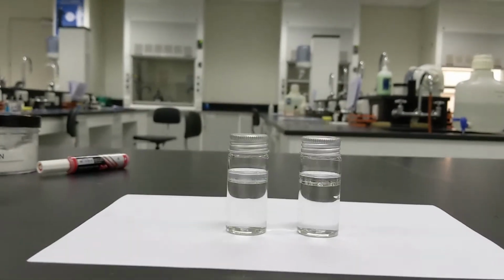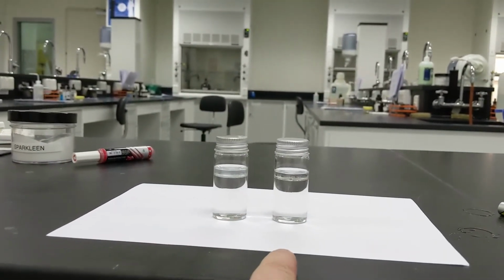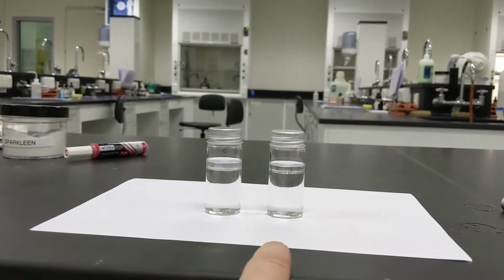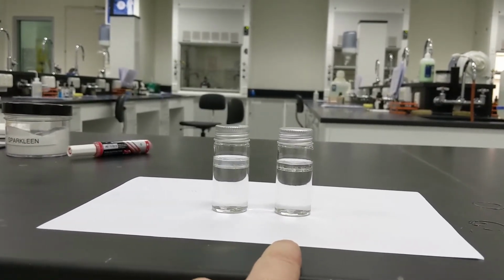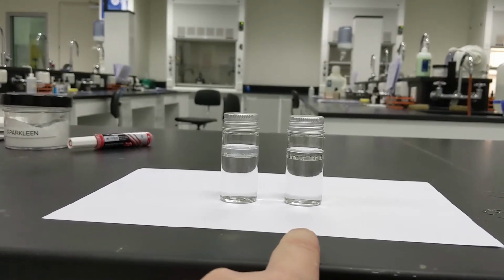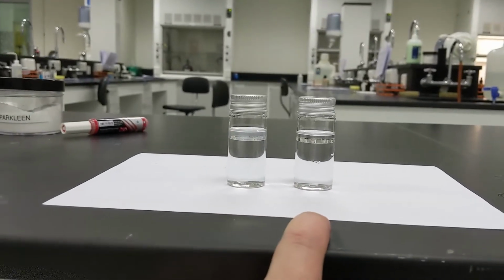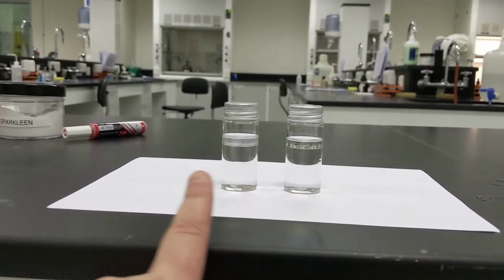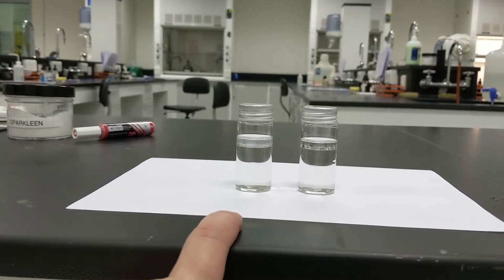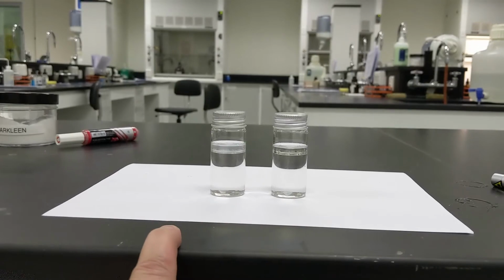I'm going to add soap to one of these, and I'm going to add an egg yolk to one of these. Now, full disclosure, I've done the egg yolk in the kitchen all the time when making some food, which I might explain a little later. I certainly have in class. I have not done the egg yolk with this, so this is truly an experiment. But I have done soap here, and we should see something happen with these heterogeneous solutions.